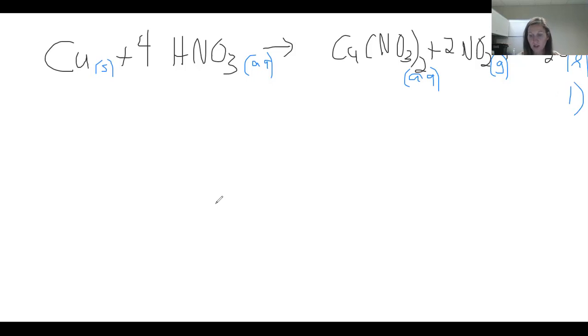All right, so you need to do that for the other, how many reactions is it? 4? Yes, the other 4 reactions for a total of 5 reactions. So you're going to write the balanced equation of each of the reactions we just watched, and they give you the balanced equations, I believe. Yeah, they give you the balanced equations on pages 63, 64, 65, so you can use those to help you with that. What they don't give you are the phases that we just covered.